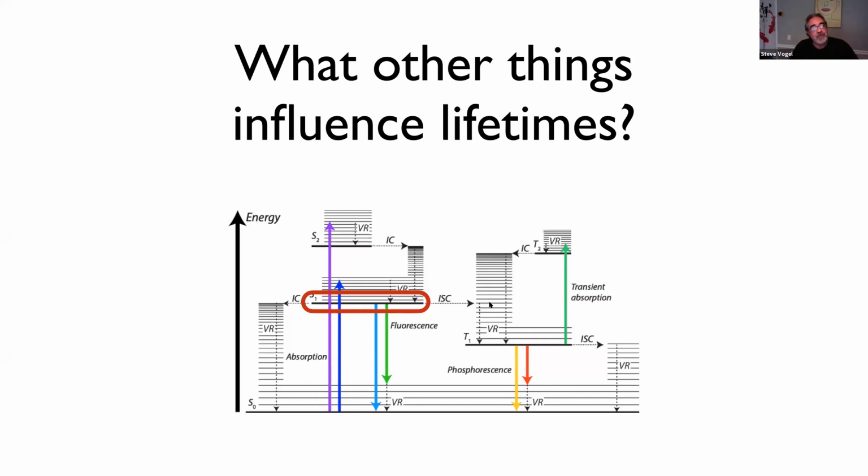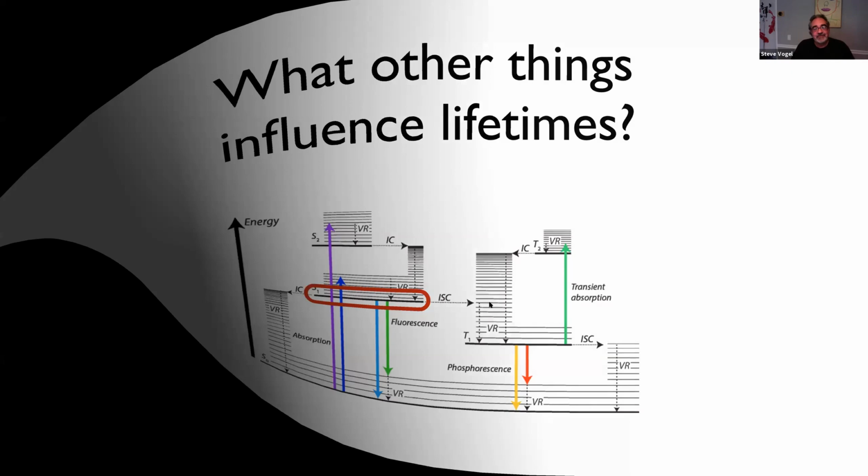So environmental factors can influence the lifetime you measure, and in many FLIM experiments, that's the main thing you're interested in, is what are the environmental factors that are changing the lifetime. In FRET experiments, you are hoping that there are no environmental factors that are changing the lifetime other than this FRET phenomenon. So now we can transition into FRET.